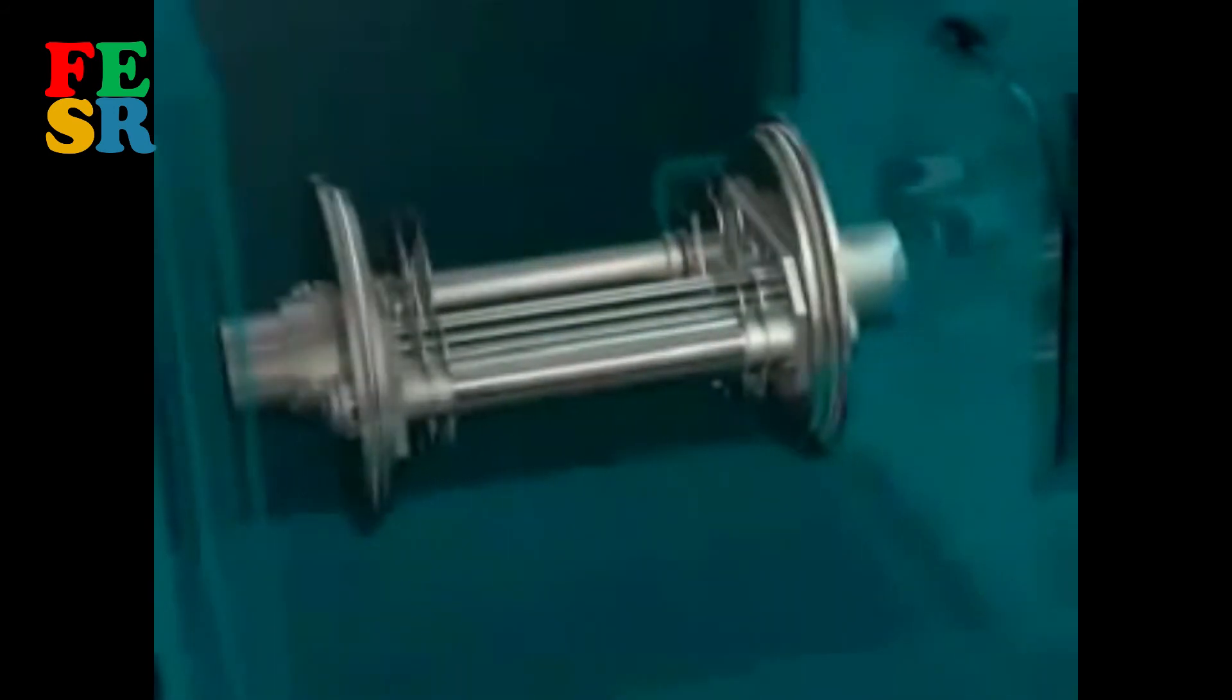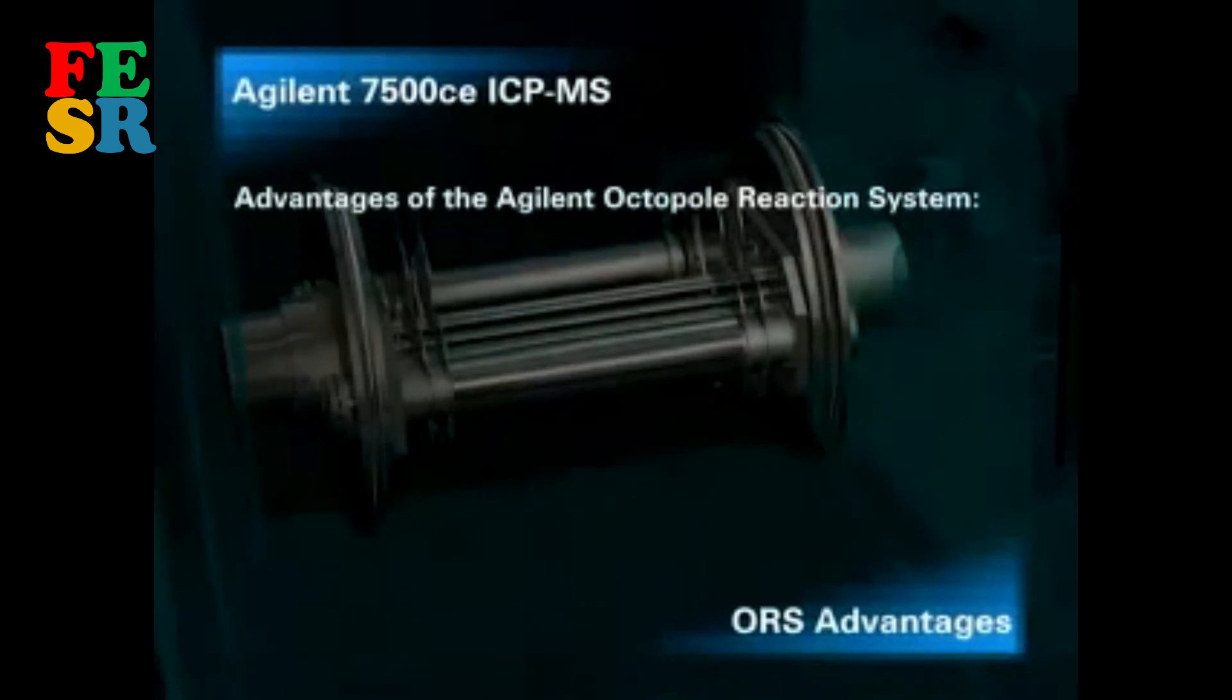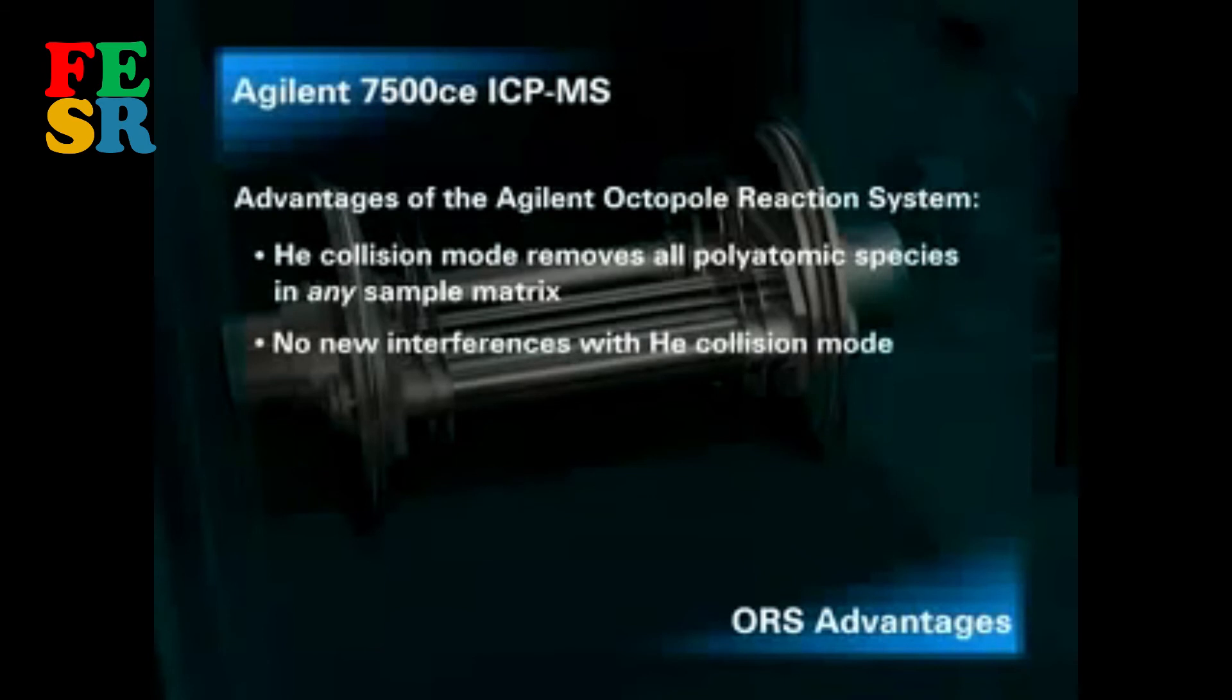The octopole reaction system offers the analyst a number of advantages. Its unique helium collision mode removes all polyatomic species simultaneously. No prior knowledge of the sample matrix is required. Unlike reactive cell gases, pure helium cell gas is inert and does not react with the analyte or sample matrix.